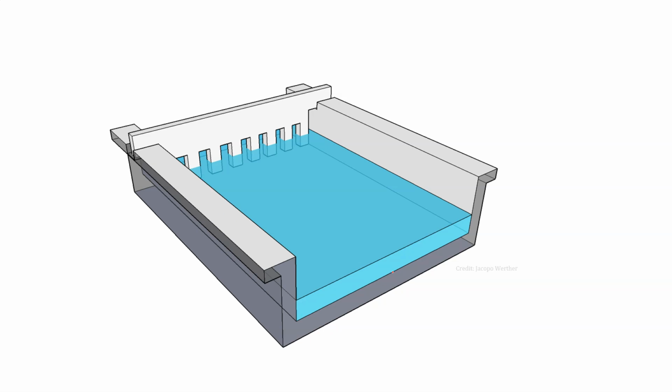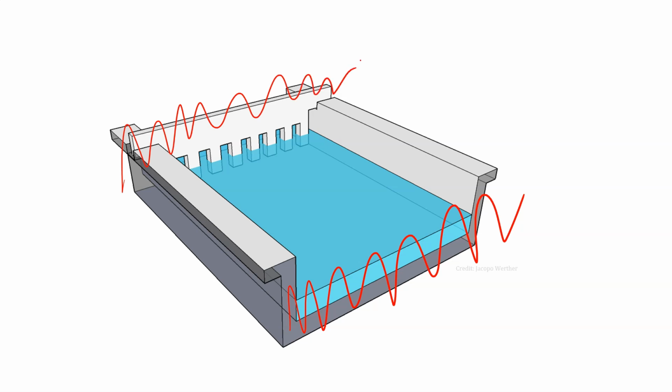So this is just a piece of plastic, and you'll tape off the two ends here and here, and we're actually in lab, so you'll get to take a crack at it. Then they put a comb in there, and then they pour what's known as agarose into the casting tray.